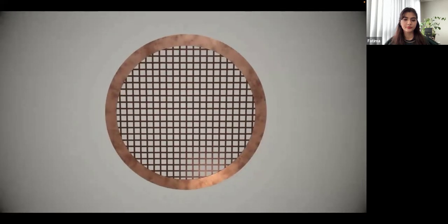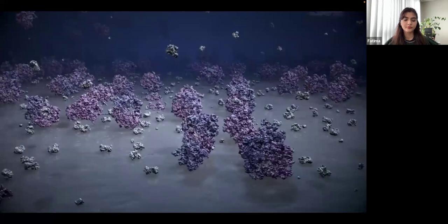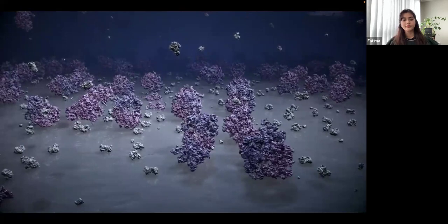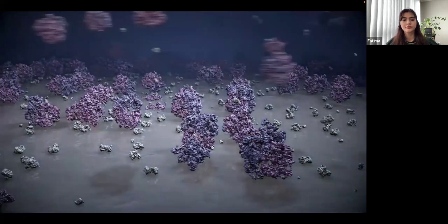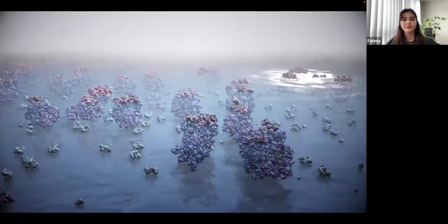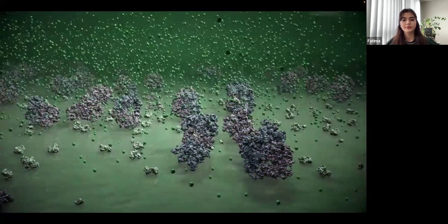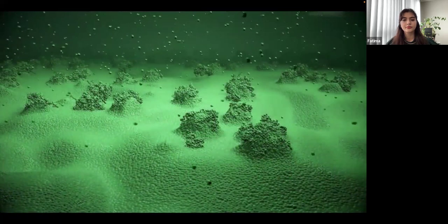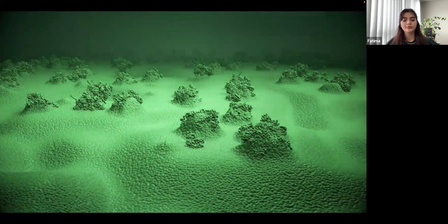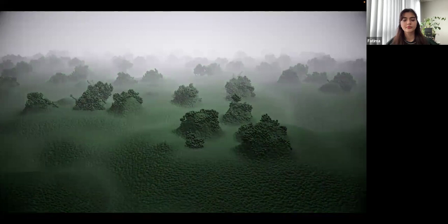If we were to view what is happening on the grid during the sample preparation stage at the nanoscale level, we would see the sample getting deposited onto the carbon film with the protein landing in random orientations. Now the excess sample is removed by blotting. The stain is then added. The stain particles uniformly coat all surfaces, covering the proteins and the carbon film. The excess stain is then removed and the sample allowed to air dry. Once the sample is dried, it's ready to be viewed using the TEM.